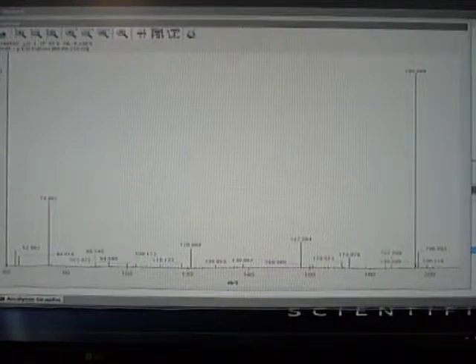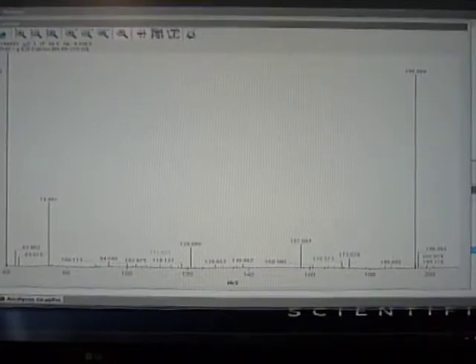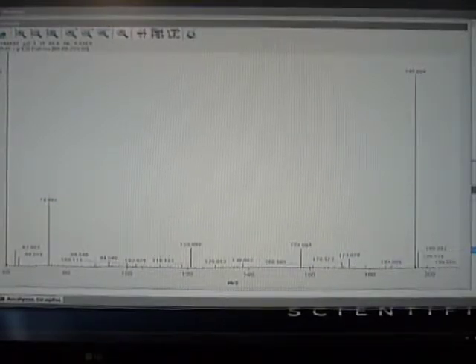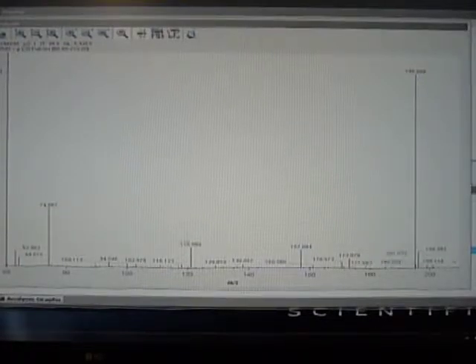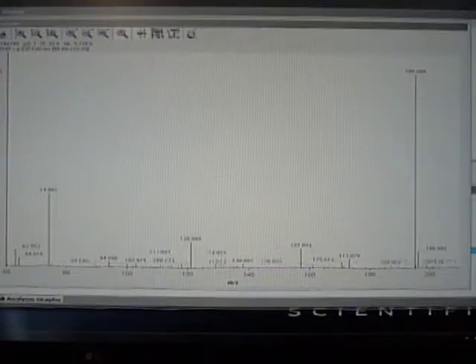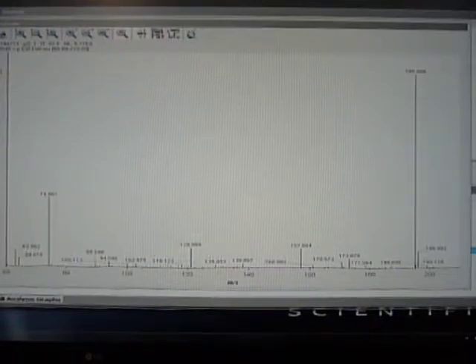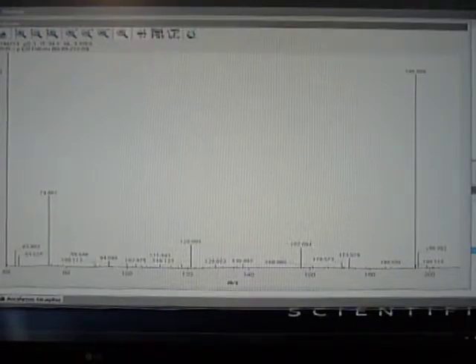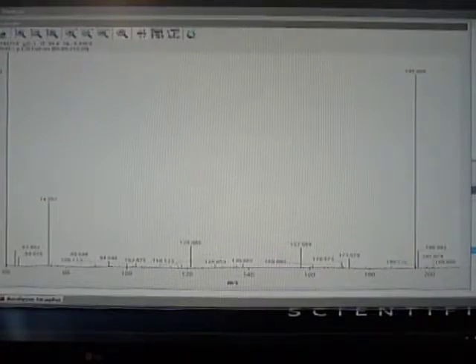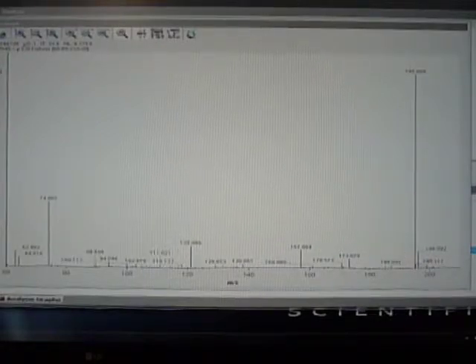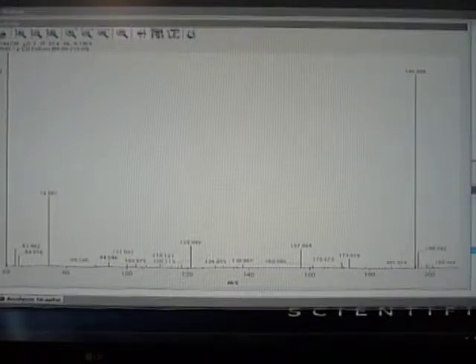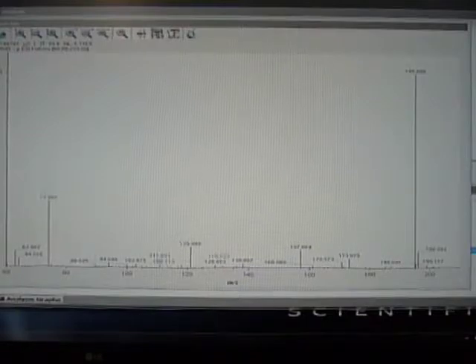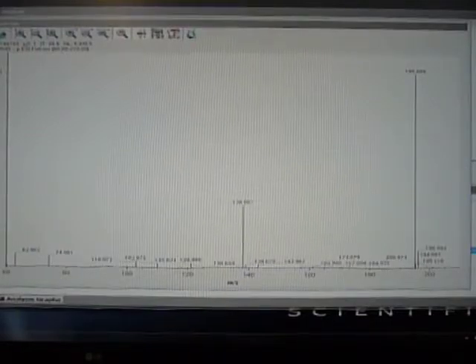We're going to do some tricks here. First of all, right now the skimmer voltage is 20 volts, and I'm going to increase it to 40. Now it's going to jump up to 40, and we're going to see something. I've got to hit apply. Now we're going to see something.